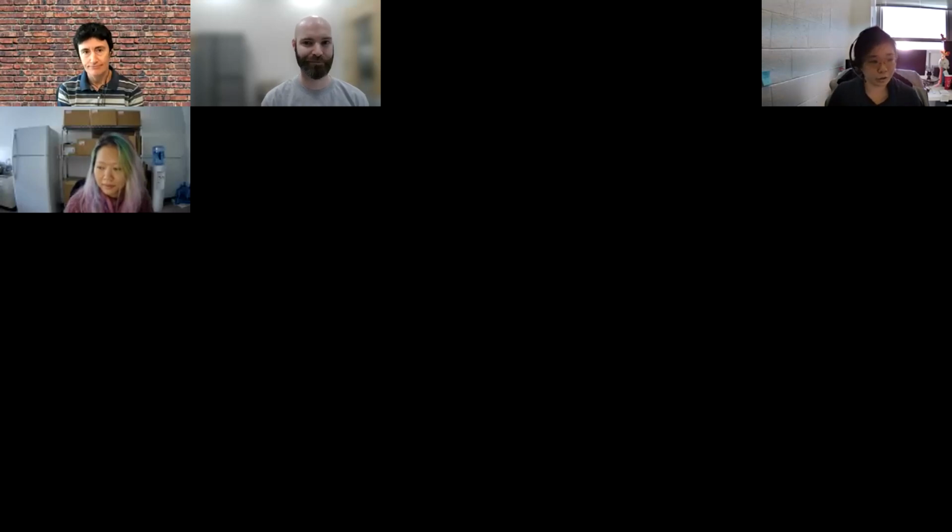So Michelle joined our team in September, and she suggested maybe we should look into using UShER as the results for the epi partners to look at. So Michelle started working on comparing the results with all of our sequences. So I'll pass it on to her to show you all what we found so far.